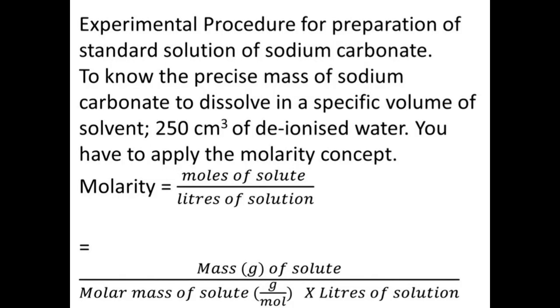The reason we are going to determine the mass is because sodium carbonate is a solid. So we will need to know the weight of the solute, this sodium carbonate, that we have to dissolve. To do this, we apply the molarity concept. Remember your molarity concept, which is moles of solute all over liters of solution. So in doing this, we will have to make the mass the subject of the formula. And from this, you would get to know that the mass is molarity times molar mass times liters of solution.